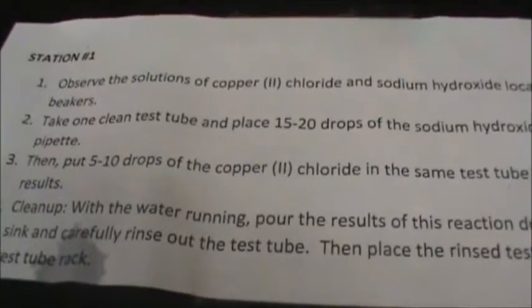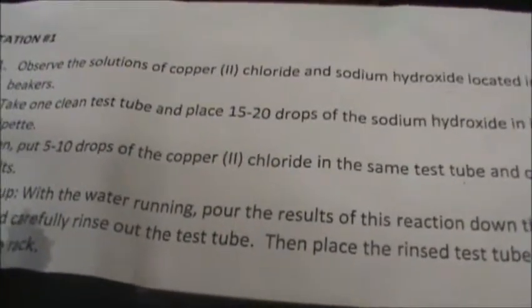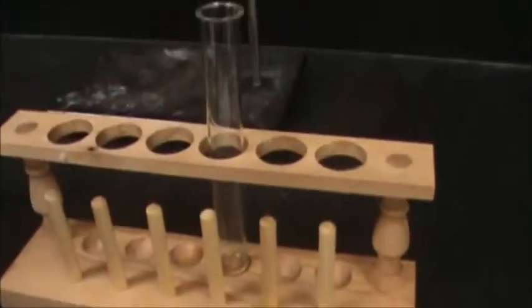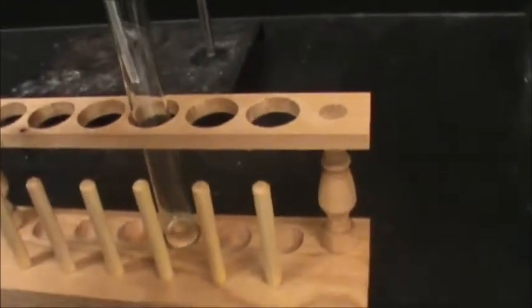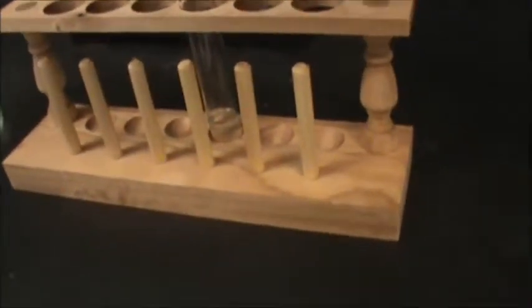It says to take 1 clean test tube, which we have right here in my test tube rack, and we are going to add some drops. We're going to put 5 to 10 drops of copper 2 chloride and 15 to 20 drops of sodium hydroxide. I am too impatient. I just do squirts. There's a squirt of sodium hydroxide into my test tube. Here is a squirt of, watch the solution, it looks like water, right? Sodium hydroxide. Now I add my copper 2 chloride. You should notice a change here.